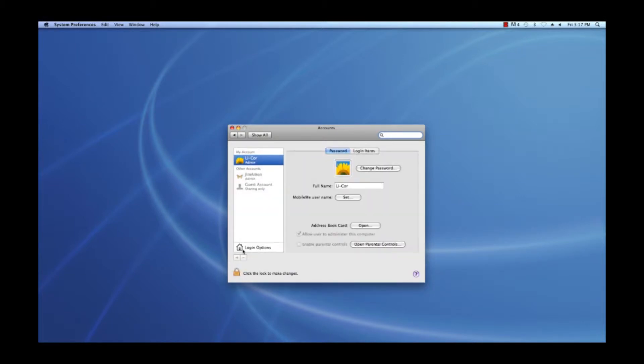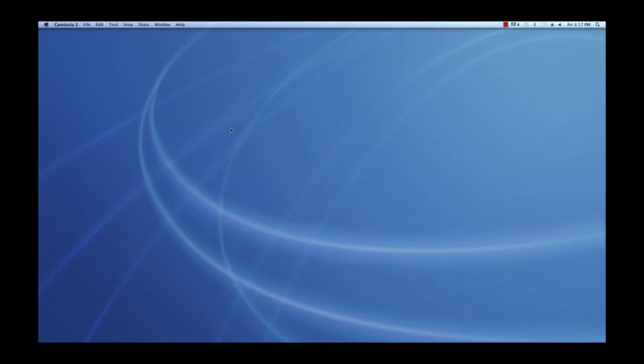If you are not sure if you are logged in with administrator privileges, log out and log back in using an administrator account. For questions regarding access to an administrator account, contact your IT department.